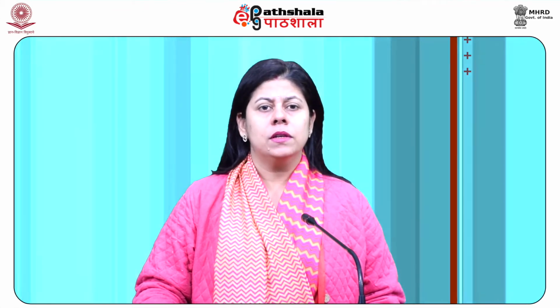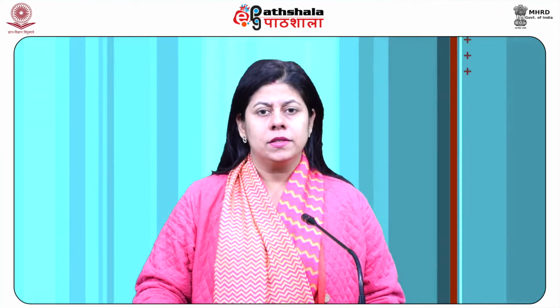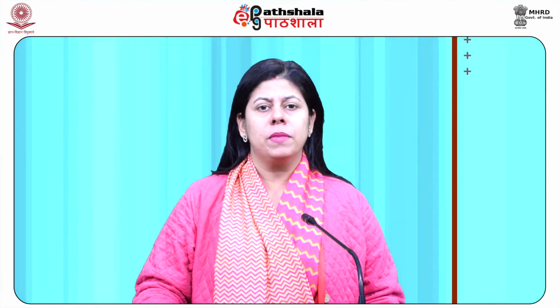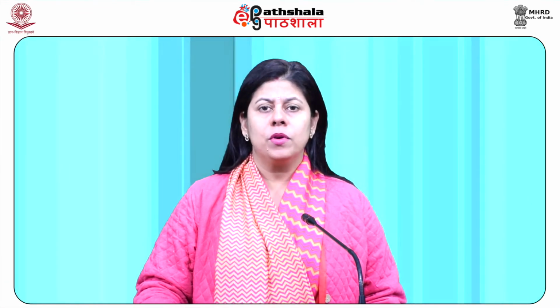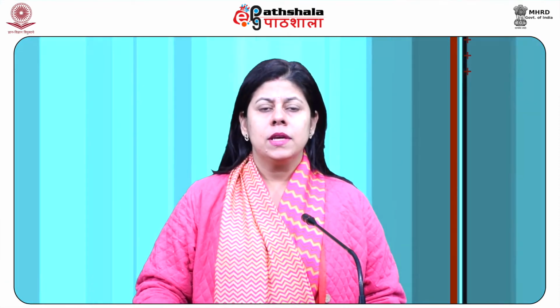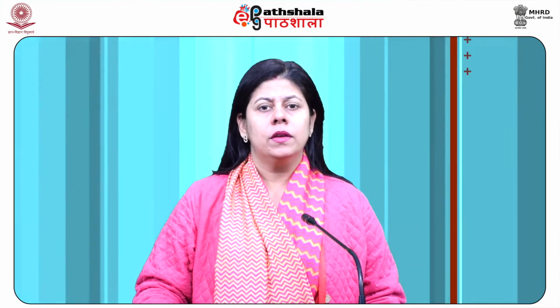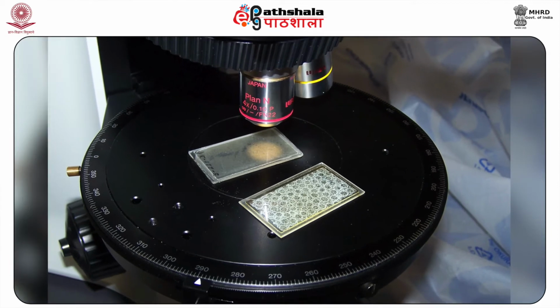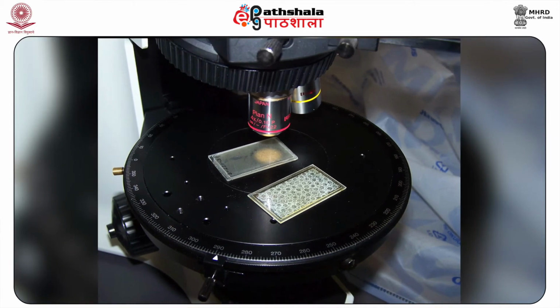Matching of the optical configuration of objective lenses and eyepiece is done in a few high performance microscopes to give optimum optical performance. This happens ordinarily with apochromatic objectives. Stage. A podium which holds a specimen which is being viewed is known as a stage. It is present beneath the objective.